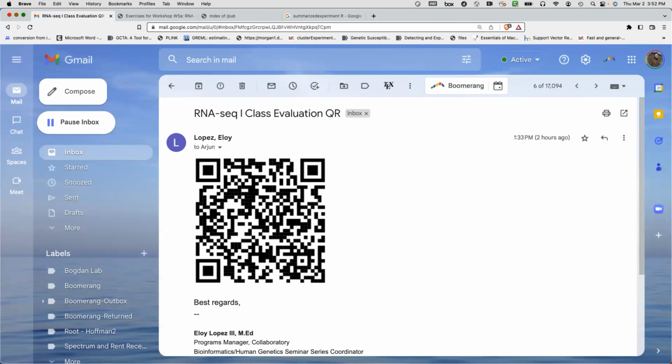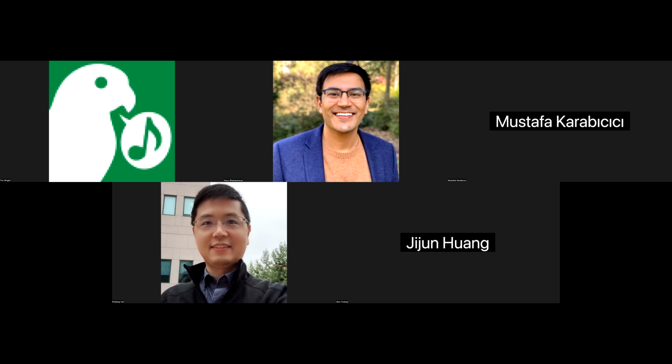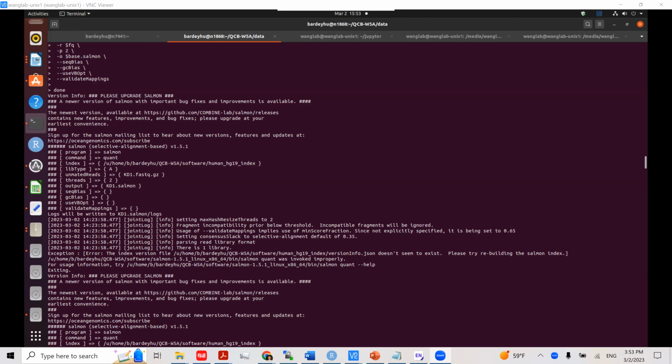Hi, Arjun. Can I share just my screen? Yeah, go ahead. Can you see my screen now? Yes, I can. At the very beginning, I want to do this assignment, and I found that there is an error here. But I do check that this JSON file exists. Did you name it properly? So did you name it HG19 or did you name it something else? The same thing.